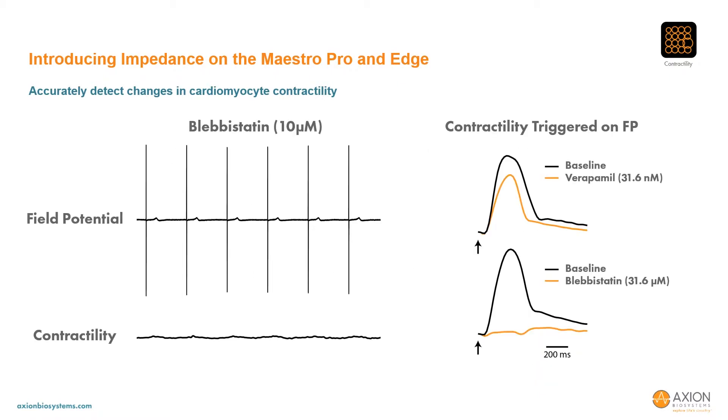Although the contractility signal was diminished with blebbistatin, the field potential signal remains unaffected. In fact, the field potential beat detection occurs simultaneous with the contractility measurement, allowing the contractility beats to be triggered on field potential depolarization, as is shown on the right. In this way, it's clear to quantify the changes in cardiomyocyte contractility before and after addition of verapamil and blebbistatin, even as the contractility signal is reduced.